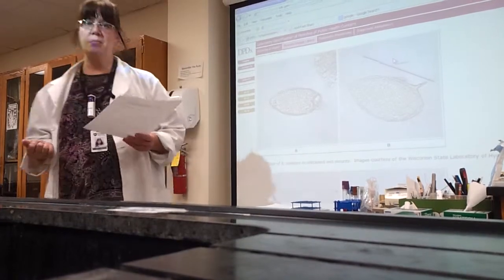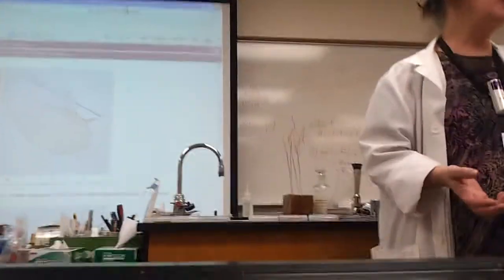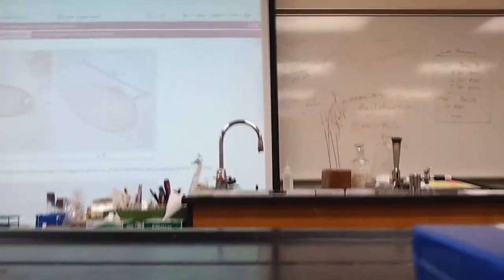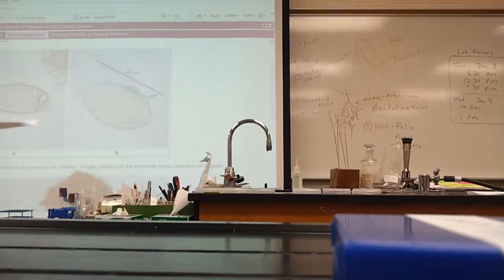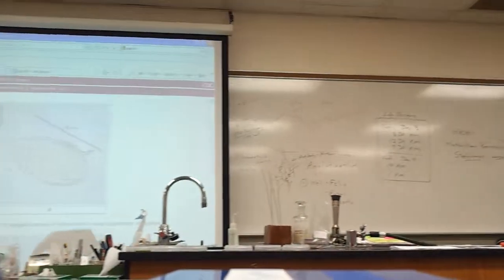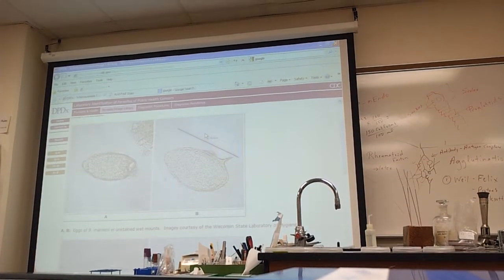Enterobius is the pinworm. If you're infected with the agent underneath the scope, you have an Enterobius or pinworm infection. I'll show you its eggs in a minute. It comes out in the anal region, and you can detect it by putting some Scotch tape there and pulling it off. Pinworm. Filaria all look like plain worms. In dogs, it's what? Heartworms. In people, it's elephantiasis. That means the swelling and blocking of the lymph ducts.